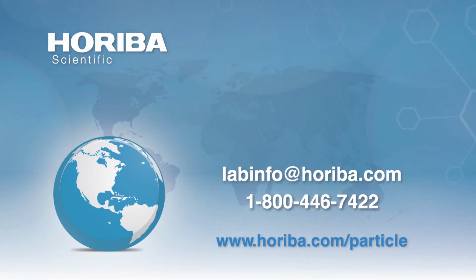You know, it's the old story. If they're free-flowing materials, dry would be a perfectly fine way to do it. If they become particularly sticky or agglomerated or things like that, typically going with wet would be a bit better because you have some more tricks up your sleeve to do the dispersion. With dry, you can do a few things. You can use some pressure differences to get them to disperse. You can put some flow aids in there, but those typically are not quite as effective as what you have wet. So if you have something tough to disperse, I would typically recommend wet. If they're easy, free-flowing, dry should be the best way to go.